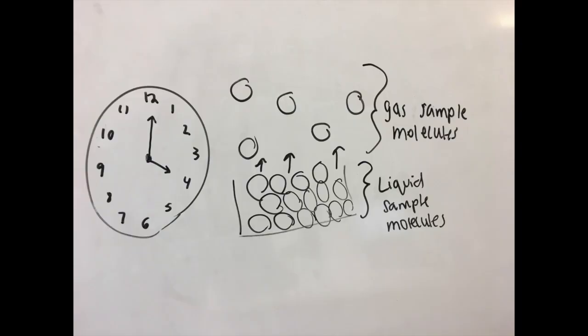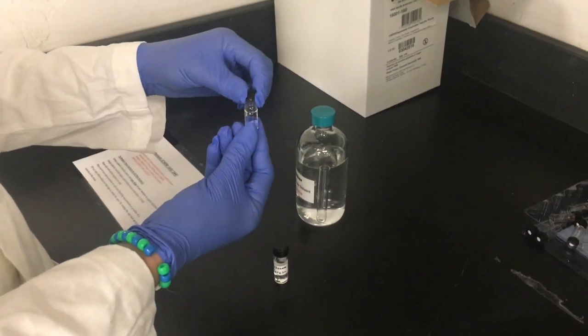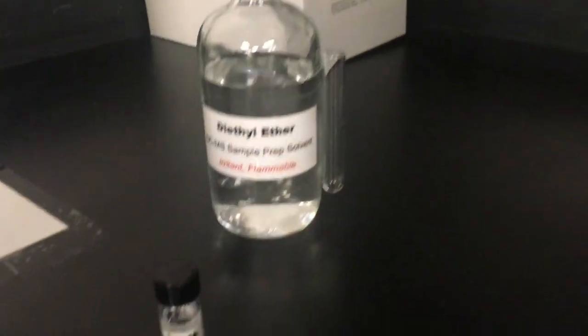GC relates the frequency of molecules in a substance to its retention time, or the amount of time it takes for the substances to exit the column in the gas phase. This differentiating characteristic is the strength of the intermolecular forces. If the forces are weaker, the substance will have a shorter retention time. If the forces are stronger, the substance will have a longer retention time. This tells us the relative strength of the intermolecular forces within a substance, as well as the number of components to a substance. While this was not extremely important to our identification, we submitted the sample to run the very necessary MS.